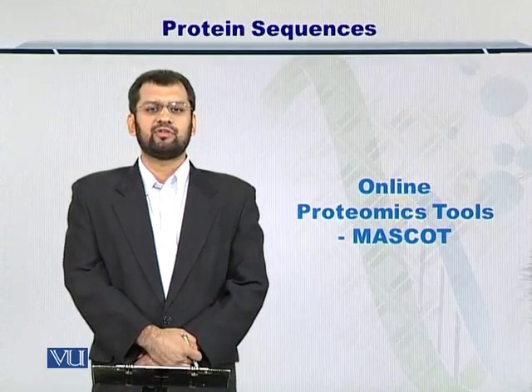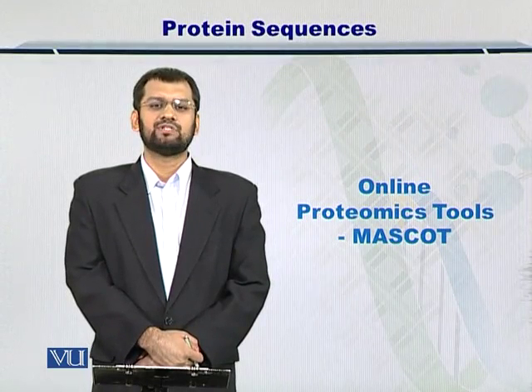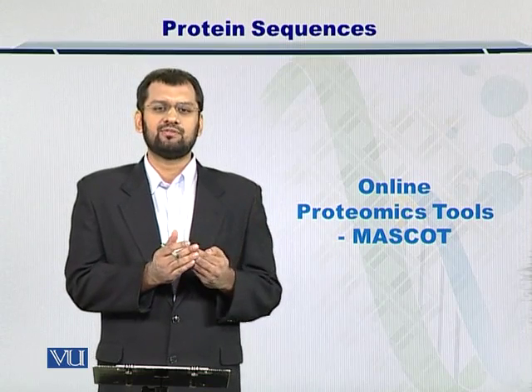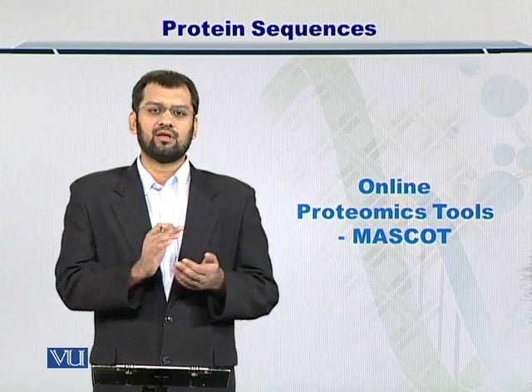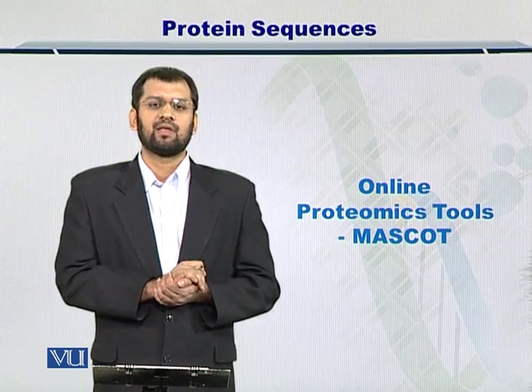Dear students, there are several proteomics tools available online which essentially help you to search your mass spectrometry data that is reported from the instruments, either in the raw file format or in the MZXML or MZML, mz data file formats. So let's take a look at the first one, MASCOT.